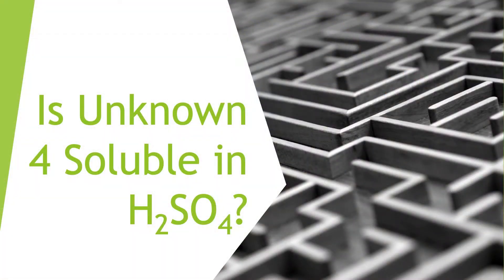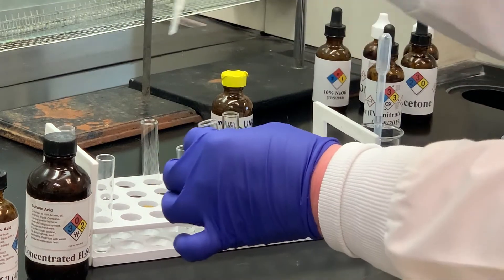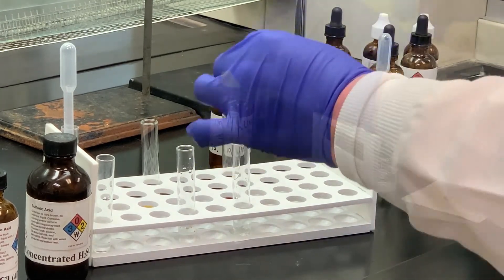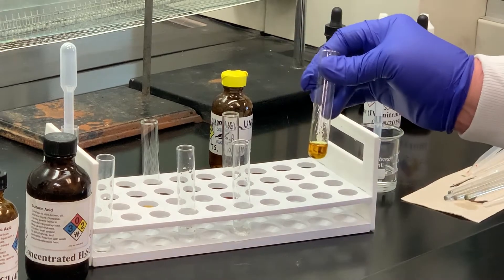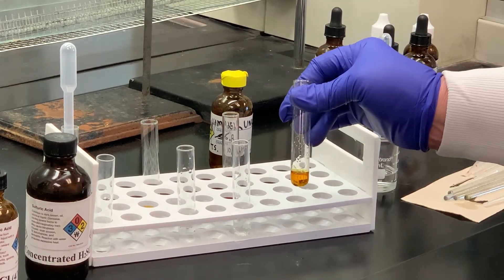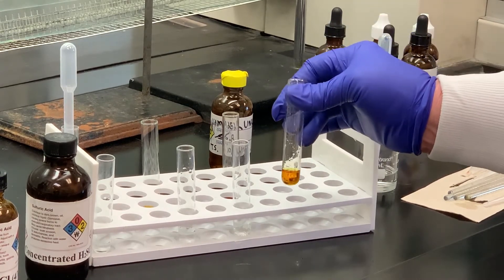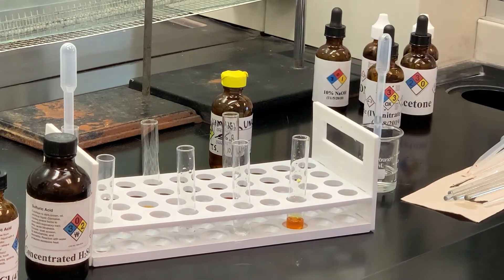By looking at the solubility chart, the last place we go is sulfuric acid. I have some sulfuric acid in a test tube and I'm going to add some of my unknown to that and stir with the stirring rod. Sometimes it may get a little warm when you use sulfuric acid — I'm not really noticing a temperature change, but if it did get warmer it's not unusual. Notice we only have one layer formed, but it did turn a yellowish color, which is characteristic of this solubility test. What we're looking at is solubility only, and there are no two layers, so we know it is soluble in sulfuric acid.